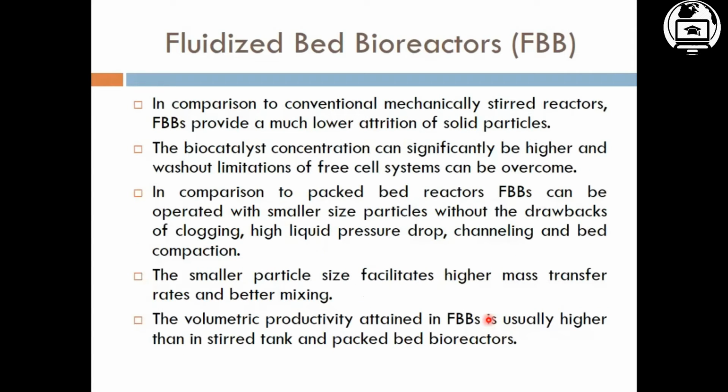In comparison to conventional mechanical stirring reactors, fluidized bed bioreactors provide much lower attrition of solid particles. Your solid particles don't get clogged or fuzzy, because there is no agitation. So the biocatalyst concentration can be significantly higher, and washout limitations of free cell systems can be overcome.